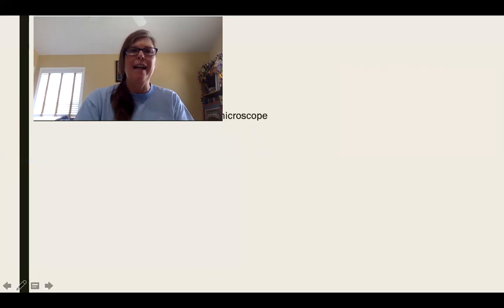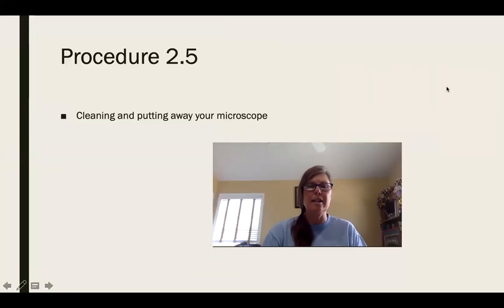All right, so the last thing that this lab talks about is cleaning and putting away your microscope. You will have noticed that there are other videos underneath this one from the lead teachers in this course, and they're going to go through all the parts, how to use it, and they're actually going to show you how to clean the microscope. Again, we're trying to get you prepared for future classes where you're really in the lab. So do please take time to watch these labs.